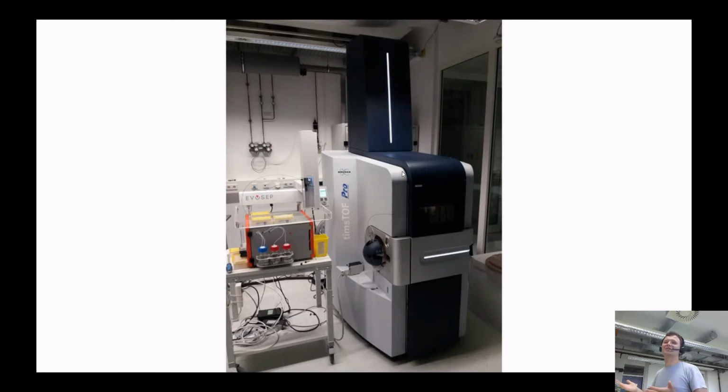But nobody actually guarantees that. If something goes wrong, the instrument can be wrong in different ways, including mass errors. Imagine that we took a temperature of 15 Celsius in the lab, and we calibrated our instrument with this sample. Now our instrument really shows masses 100, 200, 300. Cool. But what are we going to do next? Imagine the heating system broke in this lab. And now instead of 15 Celsius, we're going to have 25 Celsius, like on the street.